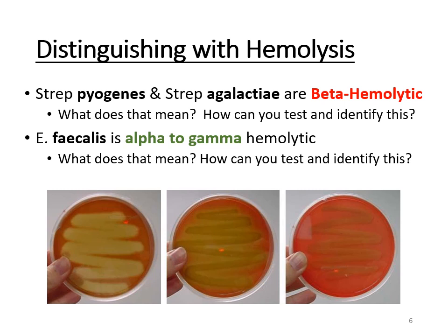Well, hemolytic activity, we already mentioned, means the breakdown of red blood cells. So the way that you would test for this is by using blood agar plates. These blood agar plates usually have 5% sheep blood in them, which is what gives them that reddish color. You then take a look where you streak your bacteria, and once the bacteria grows, you see how it affects the red blood cells in that plate.